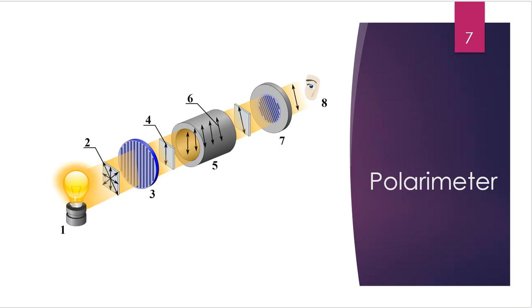But more than that, if something happens and it's not working the proper way, what are some of the pieces that could fail? And maybe how could we get some bogus numbers? So first off, I want to talk about spot number 1. And spot number 1 in this diagram is just really a light bulb.